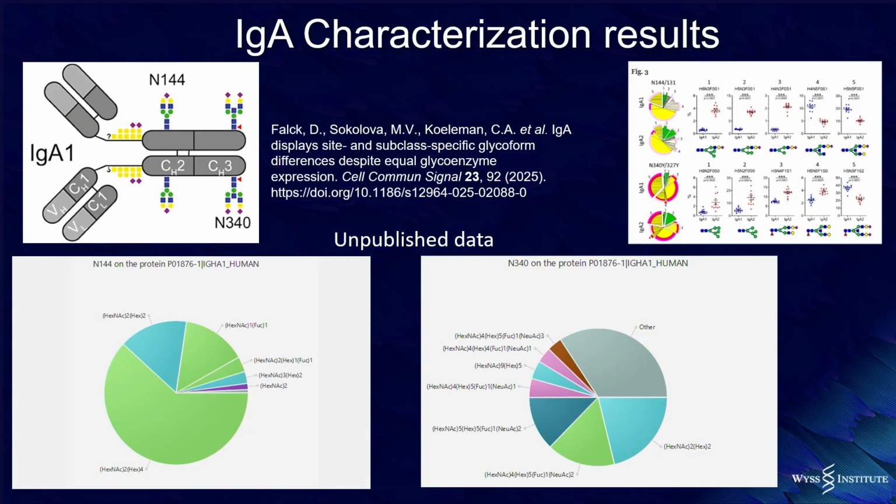We see this pie chart. I really like that PEAKS software provides you not only what sugars were detected, but what percentage of these sugars is detected, sometimes at very low abundance. I tried myself to go back to the spectra and find it, and with software, it's very hard. That's why it's easier to go to PEAKS straight. Don't even bother with the raw spectra. But it's very important to show what the main sugars are and what those that are really in the background.